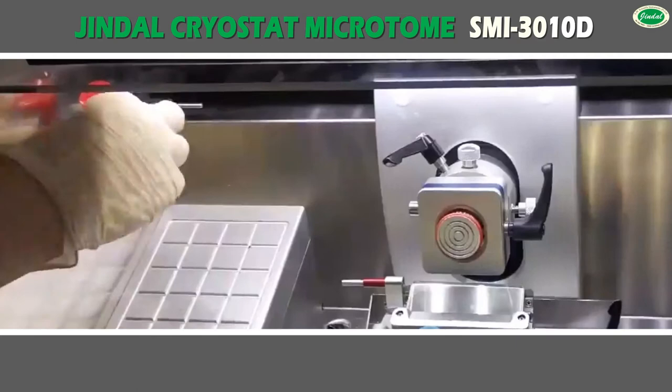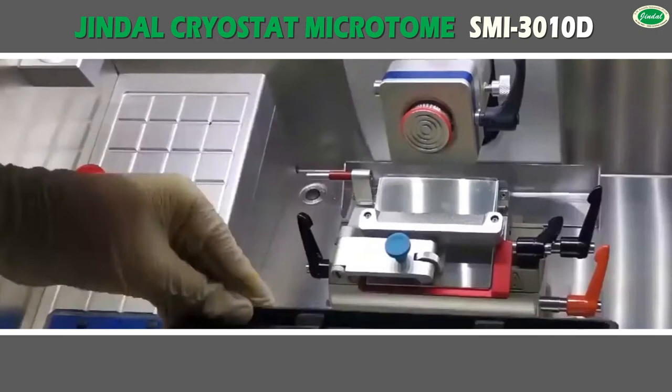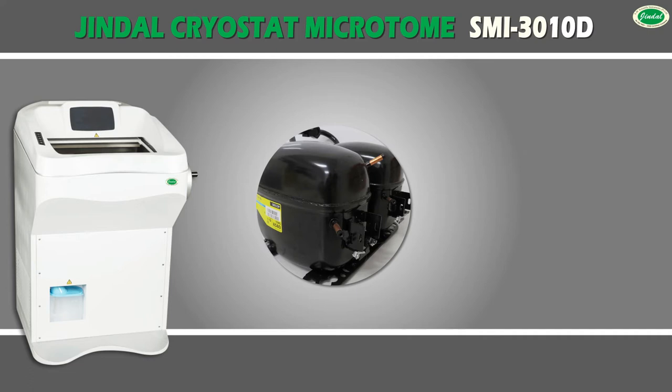The high-resolution sections meet the cytological detail requirements for pathological diagnosis, histochemistry, fluorescence, biochemistry, and microscopy. The technique is simple and easy to learn.